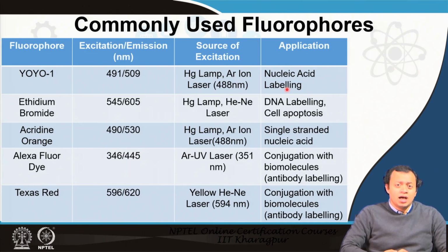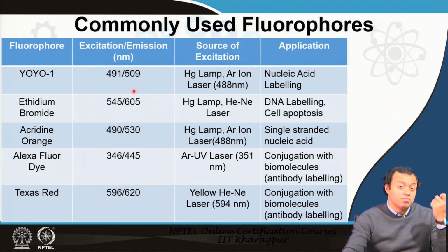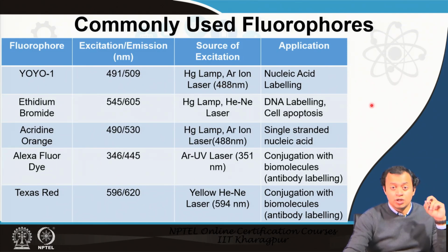They spend a huge amount of time, energy and money to develop these materials, and they are sometimes classified. They can be used for nucleic acid labeling. They can attach themselves to a specific part of the DNA, so that area fluoresces and can be imaged using different argon lamps. So, this table is something that you should look into to understand, but this is not the important part.